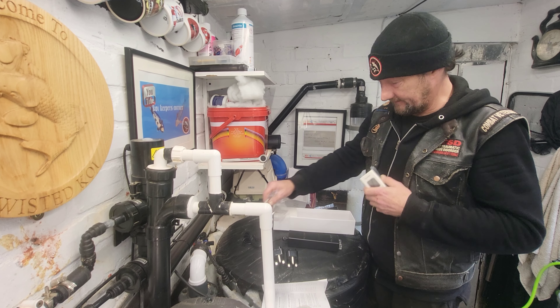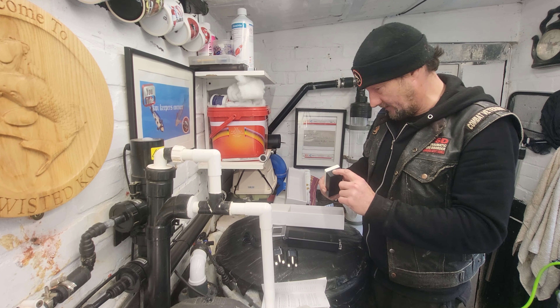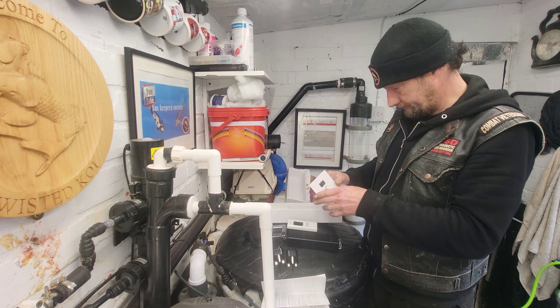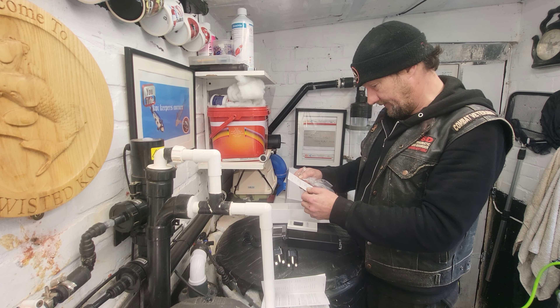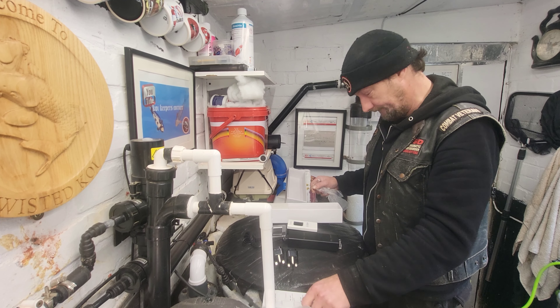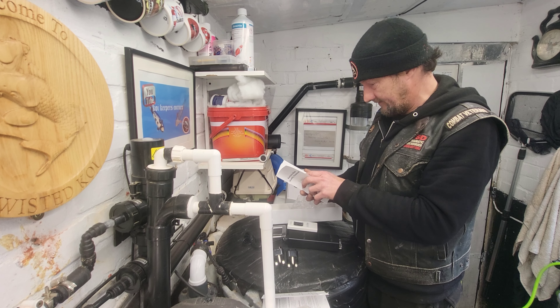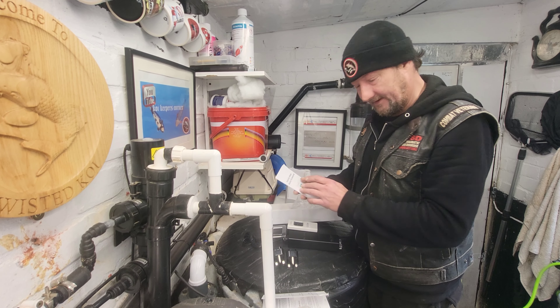We get a universal plug - actually two universal plugs. That must be your probe and sensor, and that must be for mounting the control box. It has a USB-C on the bottom. There's also a card telling you where your water level needs to be - maximum water level to keep underwater, recommended level. I've got a bit of a leak so I'll put this at the maximum level.